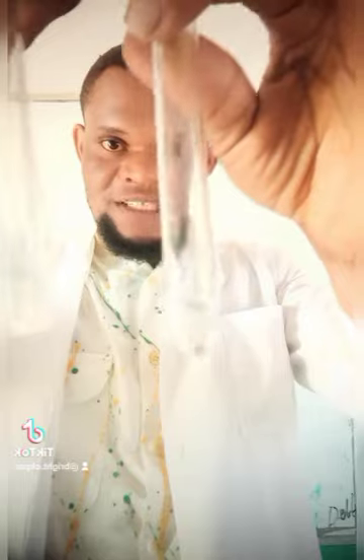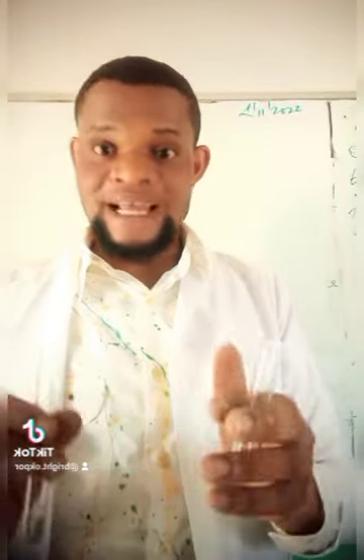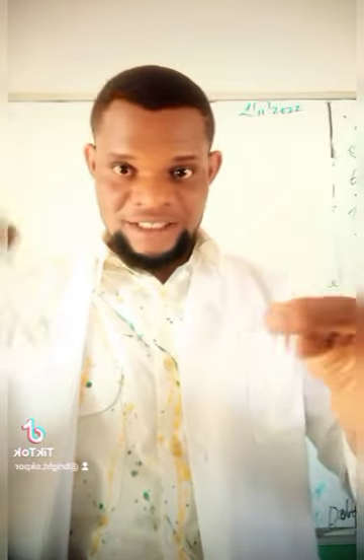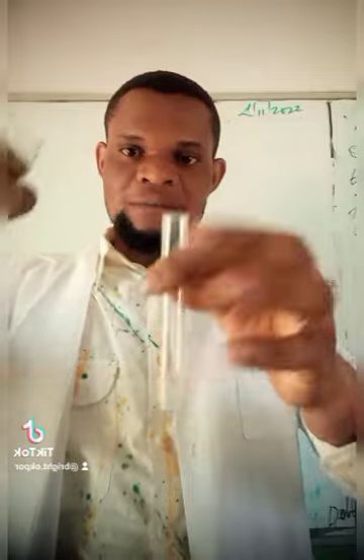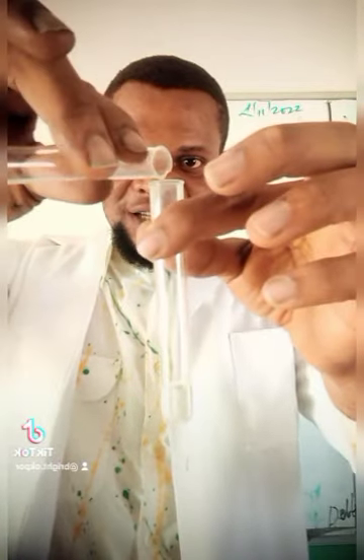So they are actually dissolved, so there are no more particles. What we do is we are going to react them. I'll write the chemical reaction on the board for you to follow. So I'm going to react these two aqueous substances now. They're already in solution, no more solid, as it were. So I'm going to pour one into the other, and please watch out for the reaction.